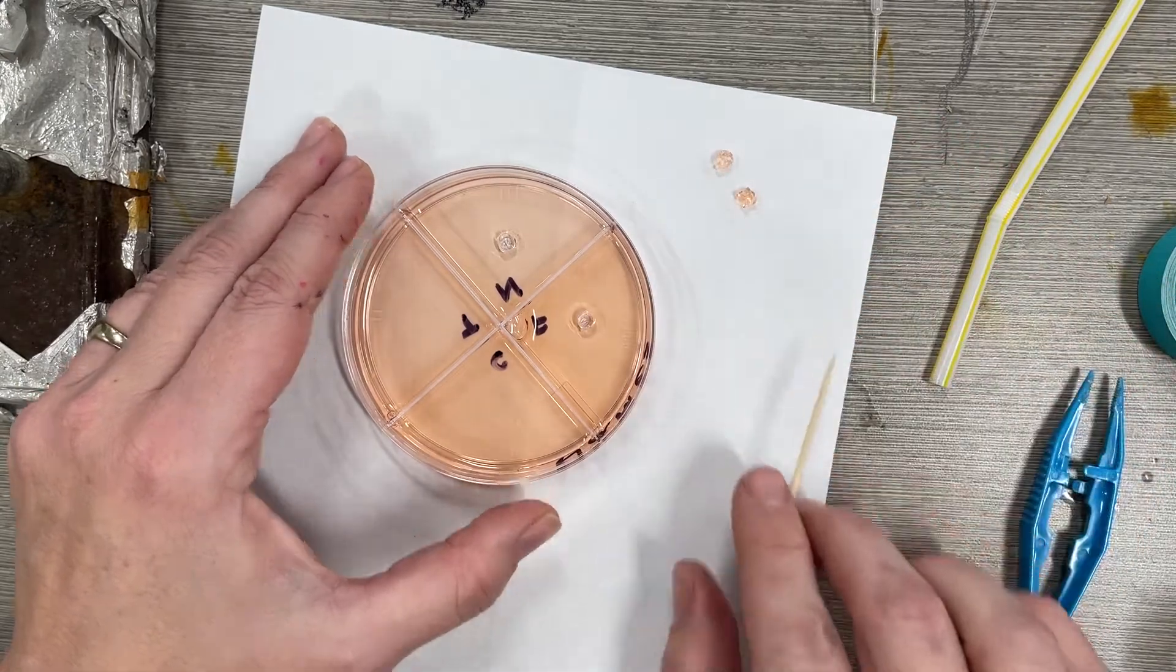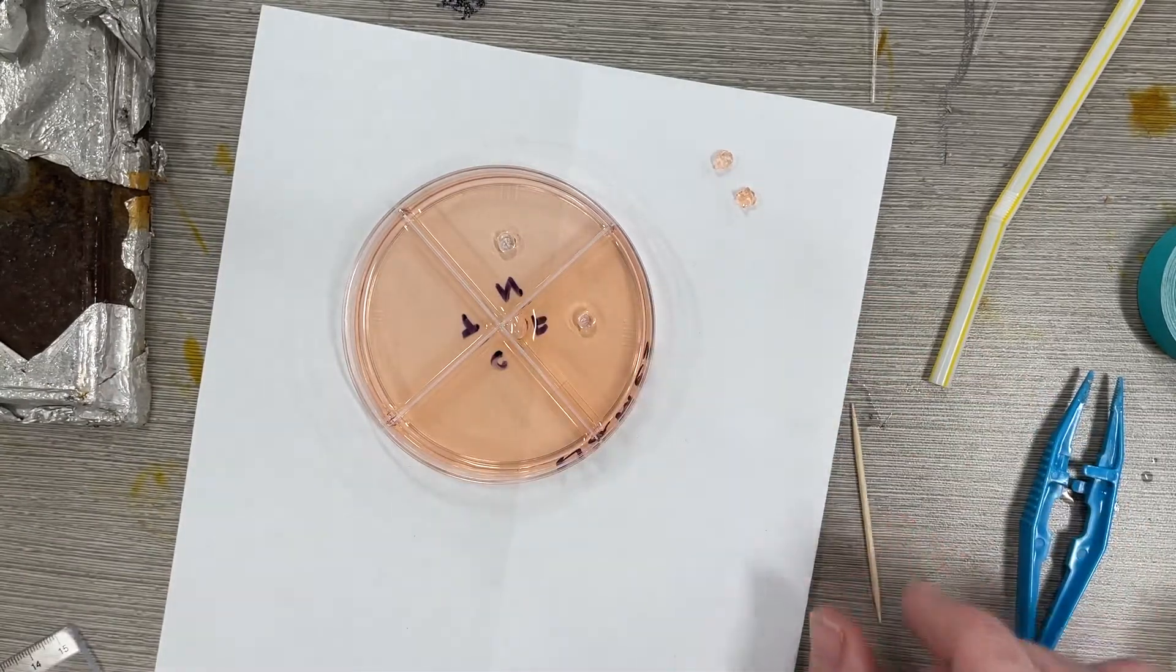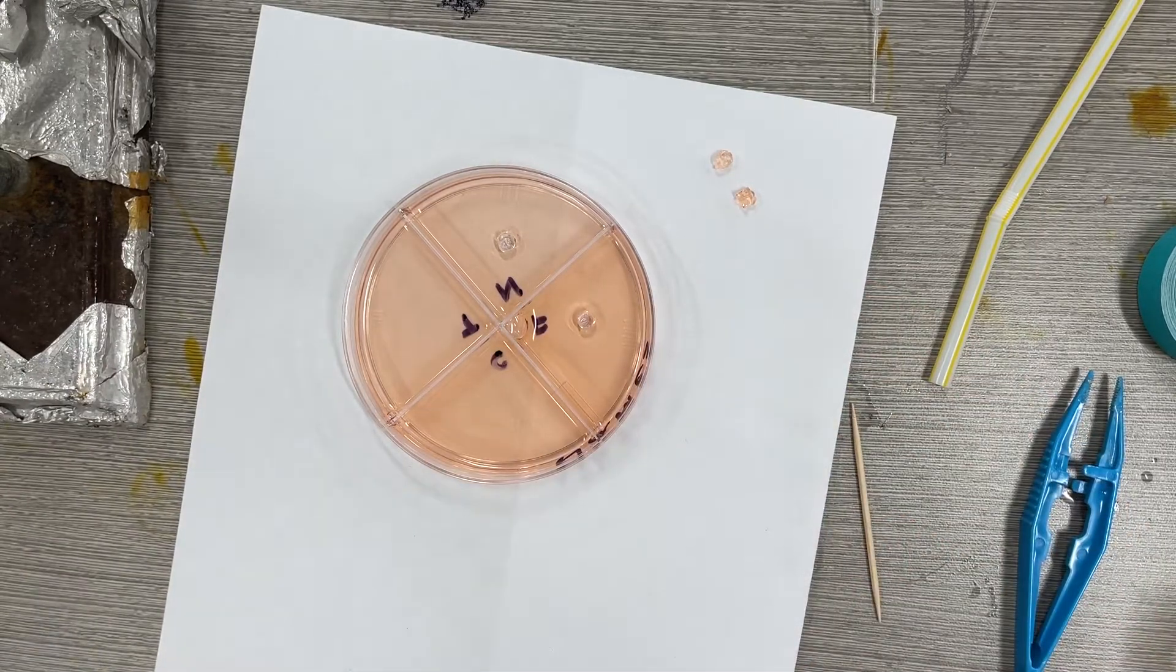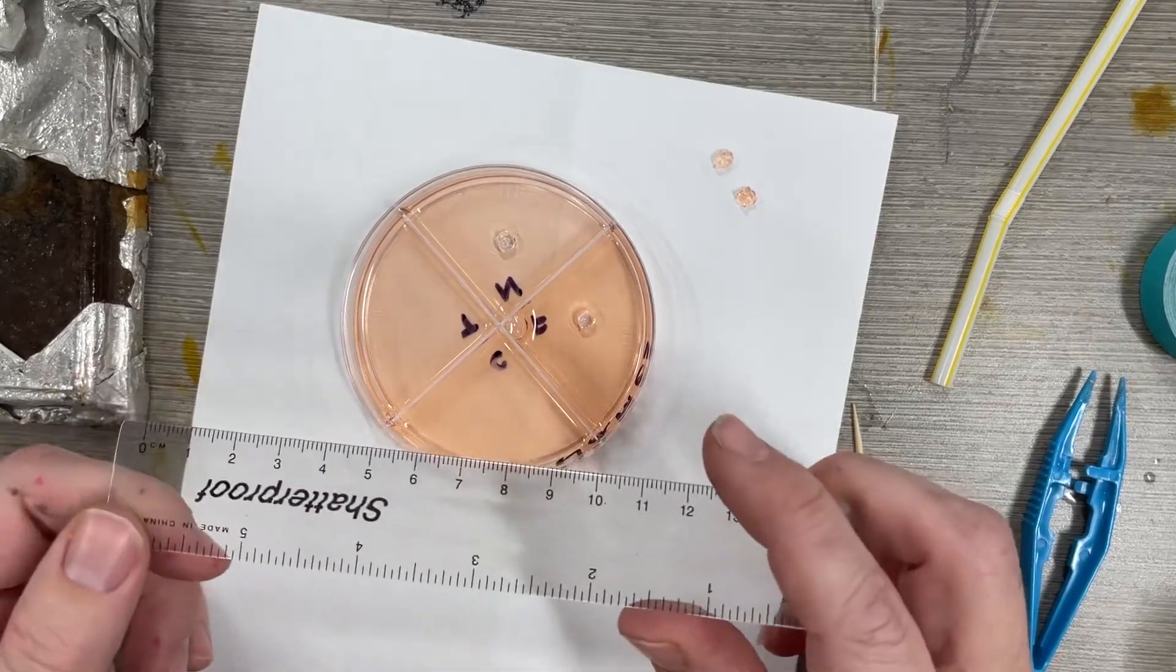I'll do that for the remaining wells so I have four holes on here. Before I put my solutions in, I want to make sure I take the measurement for the diameter of the largest part of my core sample.